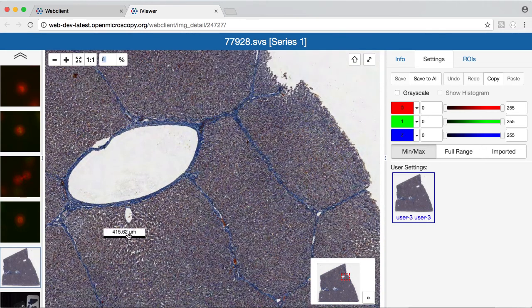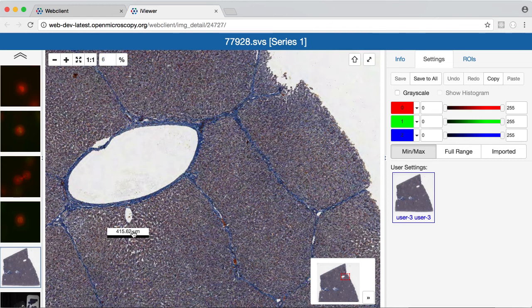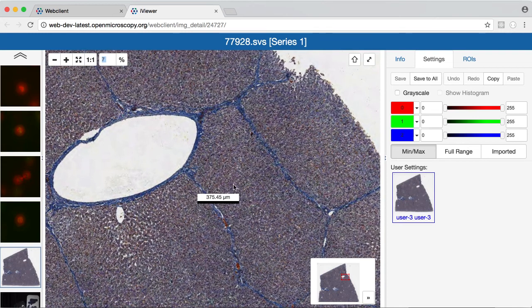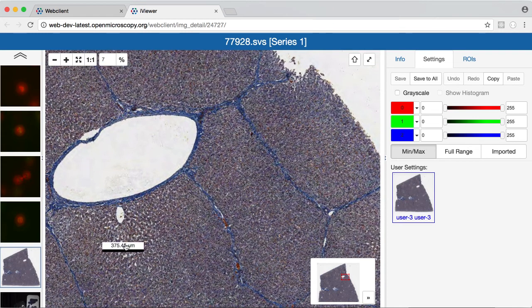I can drag the scale bar from the corner here to position it anywhere on the image, and you can see this is updated as we zoom.